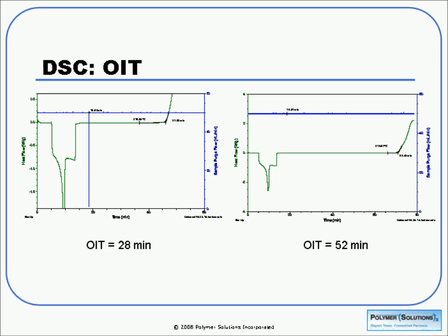So this is information that tells us that perhaps this isn't really PVC, or that there's something else there as well. So you can see how we can use it to confirm composition in some cases.